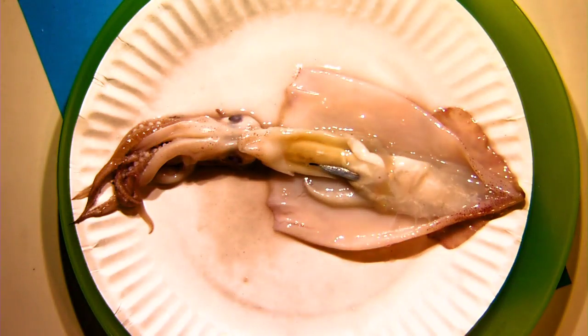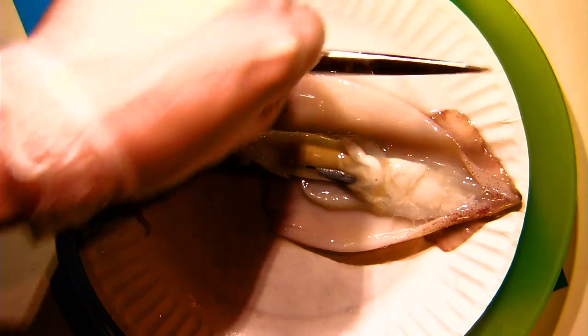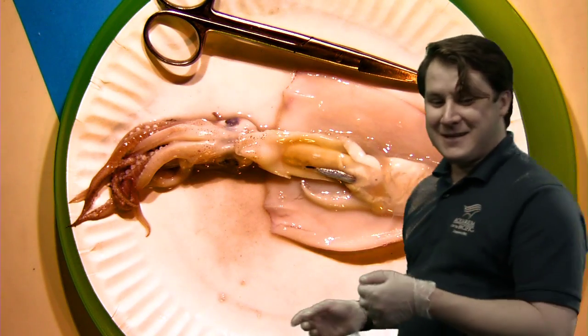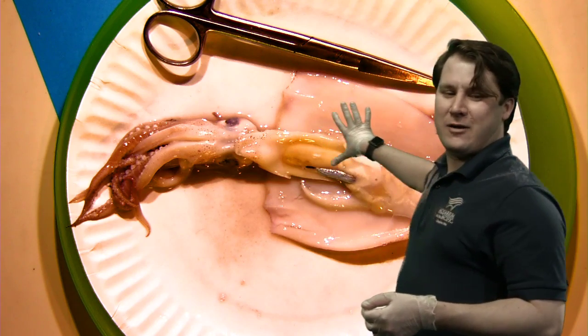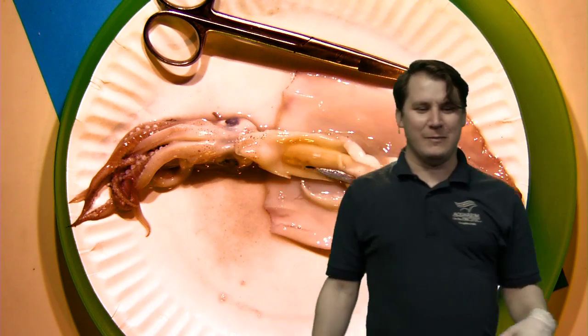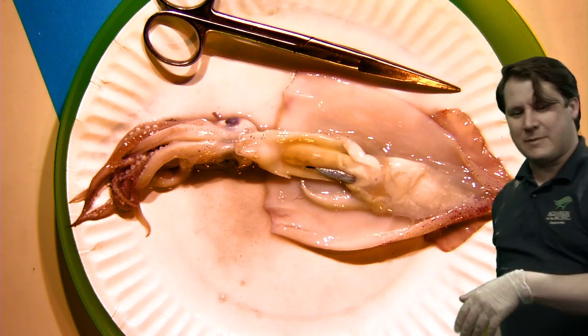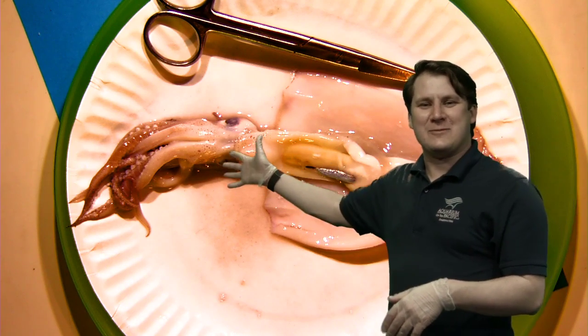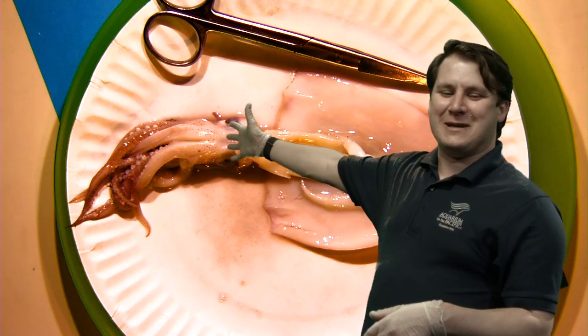Voila! This is already much better than my squid last week — that one had a broken ink sac, so when I opened it up it was all brown and blue with goop everywhere. This one looks a little bit better, though still not the most appetizing thing you've ever looked at. We're looking at digestive organs and stuff here, which people generally don't find too appealing.